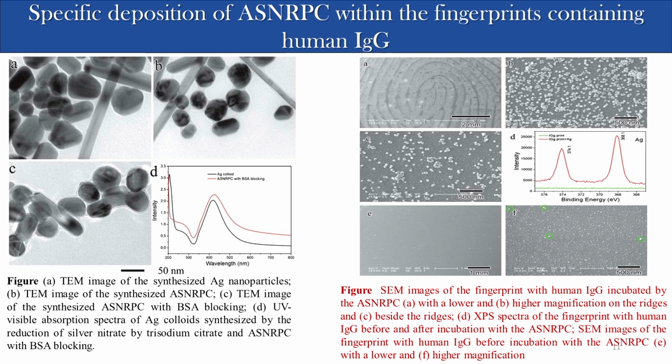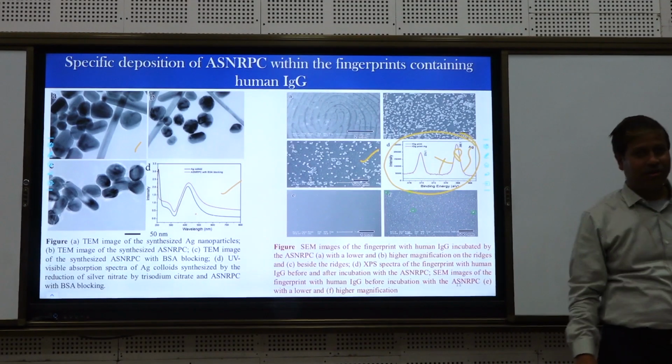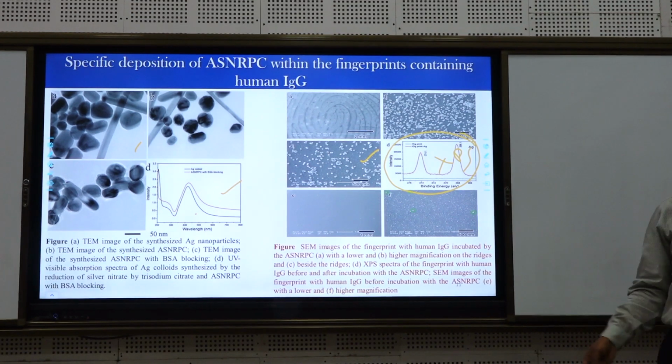Now how is it possible, if it is done by biologists, because we cannot handle protein and all this antibody? So if it is done by biologists, how do they do this? This is in the domain of a physicist or chemist, a physical chemist. And this is purely spectroscopy, XPS, photoelectron spectroscopy.